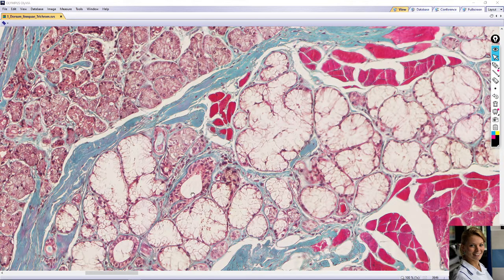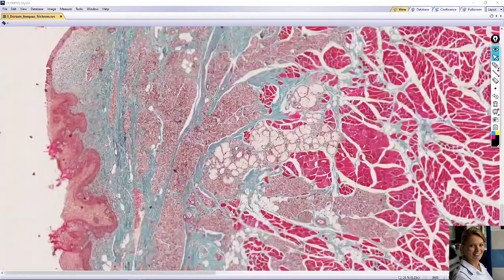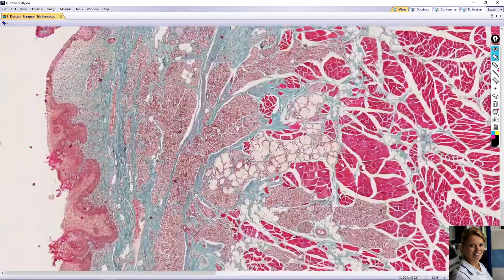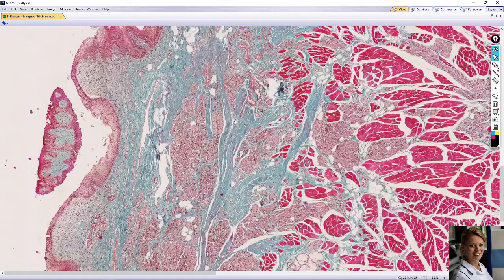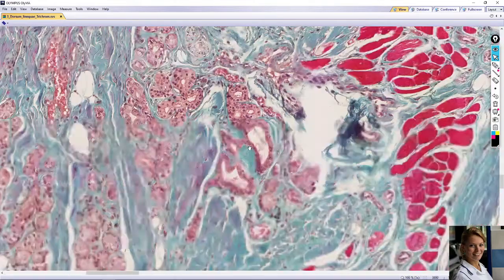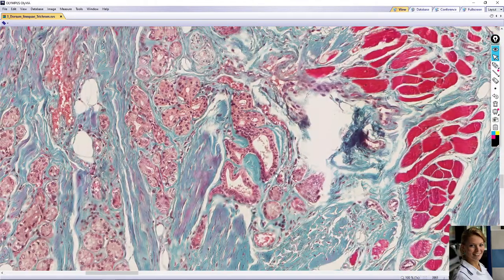The duct of these glands is lined with one layer of cuboidal cells. Sometimes the bigger duct is lined with two layers of cuboidal cells. Here is also a duct of the serous gland.